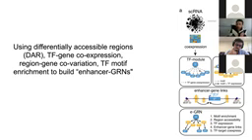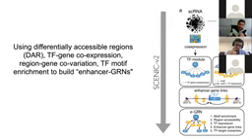So we can try to build again these regulatory networks. In this case, we are moving to a new version, SCENIC version 2, which takes single-cell RNA and single-cell ATAC as input to derive these enhancer GRNs. They use the co-expression of the TF with the target gene, but also the co-accessibility of the regions in that cell type, the motif enrichment of that factor in those regions, and the link between the region and the target gene. A bit similar, but slightly more advanced than what we did in the eye disc.